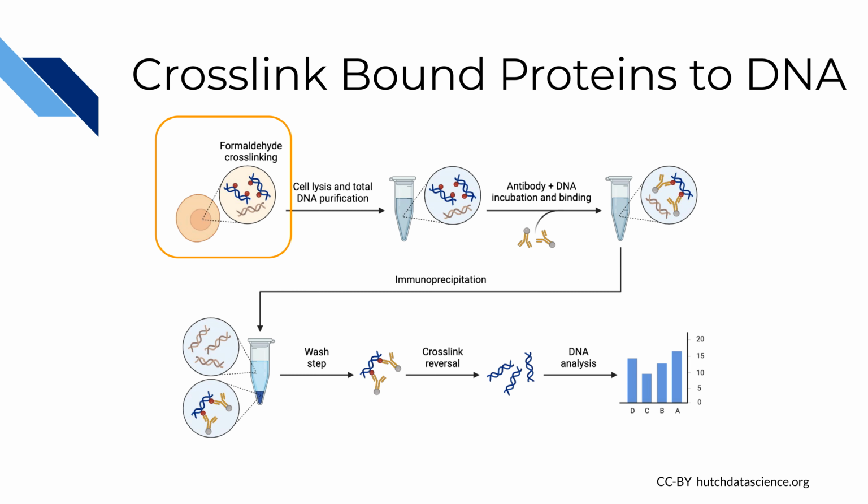Once we've isolated the cells we plan to study, we first cross-link the protein that is bound to DNA. This step keeps all protein-DNA interactions intact and prevents the proteins from separating from the bound DNA. Cross-linking steps are important in ChIP, as it preserves the protein-DNA interactions we intend to study. The cross-linking steps are completely reversible upon completion of the ChIP experiment.